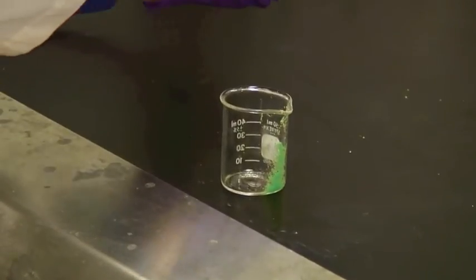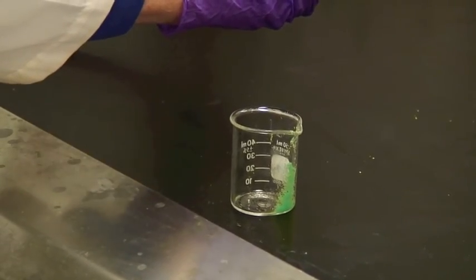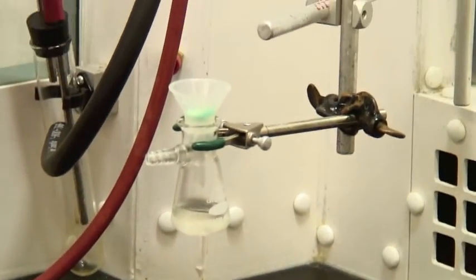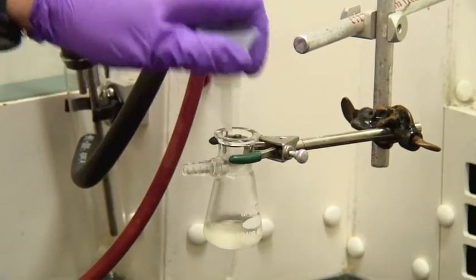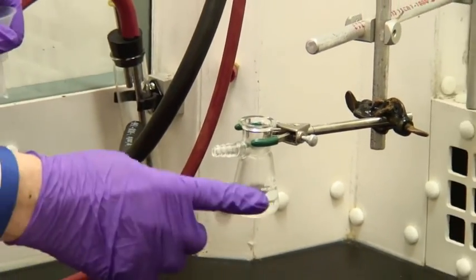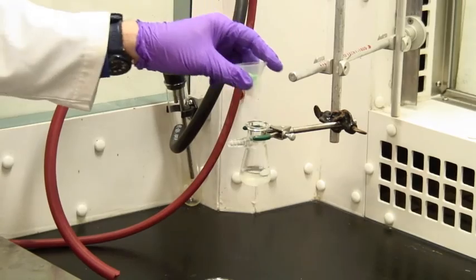If all you're interested in is the liquid, then just disconnect the vacuum, turn it off, remove this and you're done by pouring this liquid into another vessel.